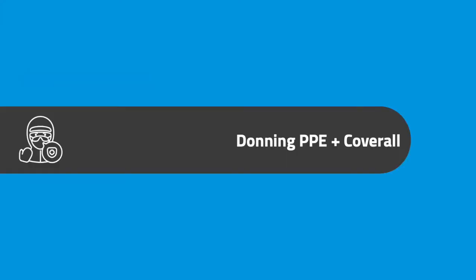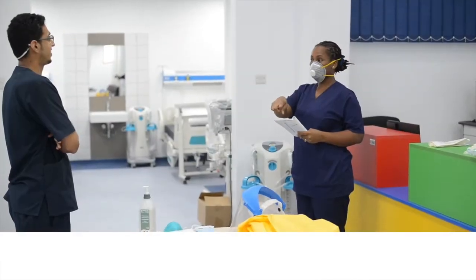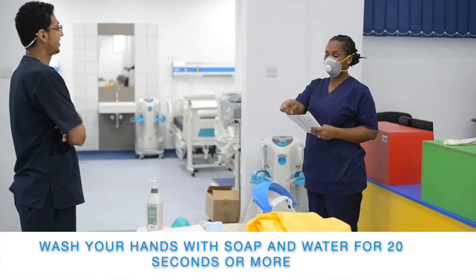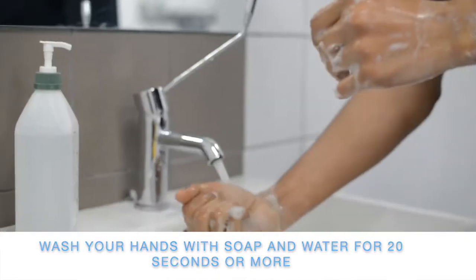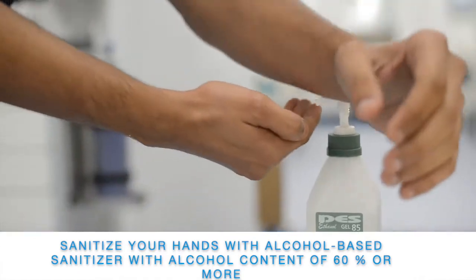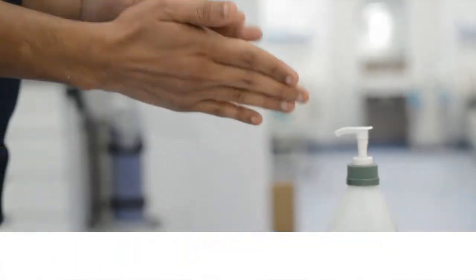Donning PPE and coverall. Wash your hands with soap and water for 20 seconds or more, or sanitise your hands with an alcohol-based hand sanitiser of an alcohol content of 60% or more.